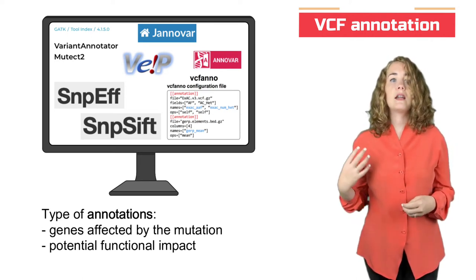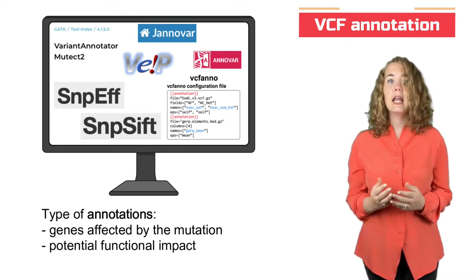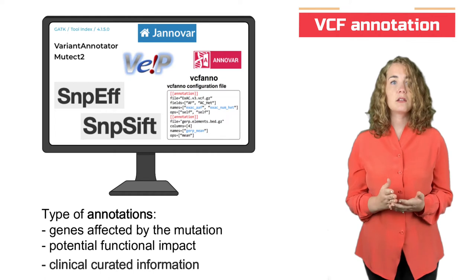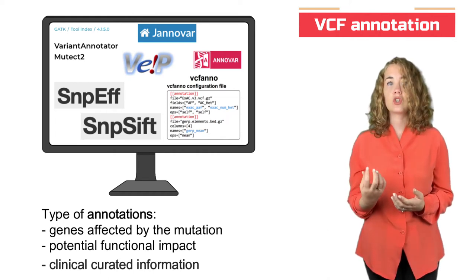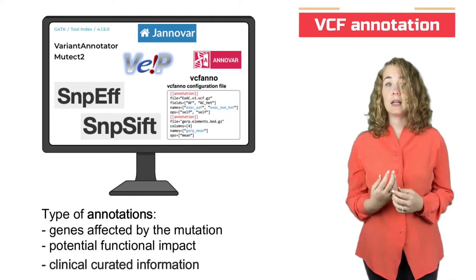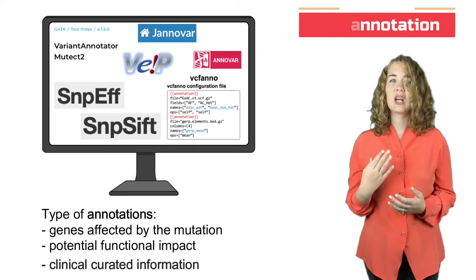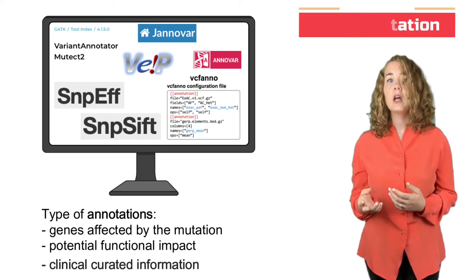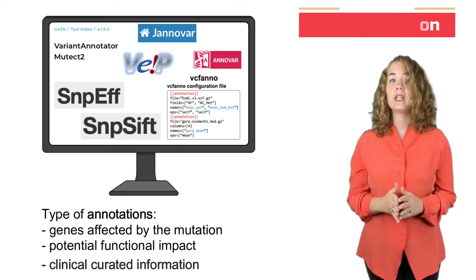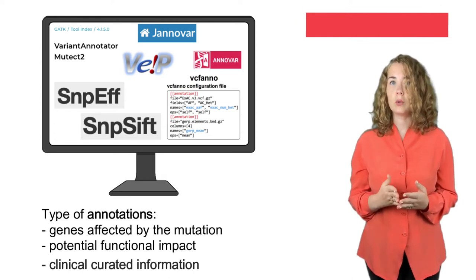Moreover, to identify disease-causing mutations and prioritize potential drug targets, clinical curated databases updated by International Tumor Boards can be screened. It must be kept in mind, however, that filtering and annotating mutations are crucial but challenging steps of the analysis, which often need to be manually curated to account for the specificity of the tumor.